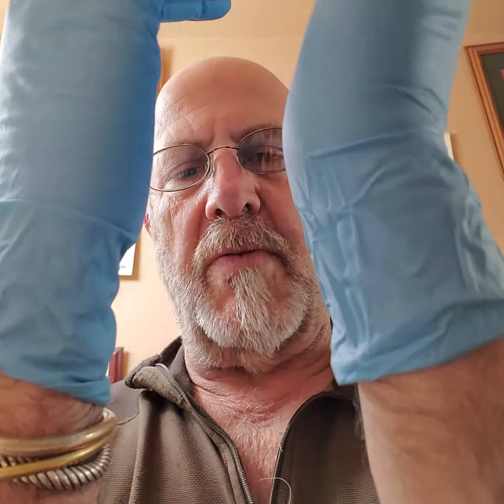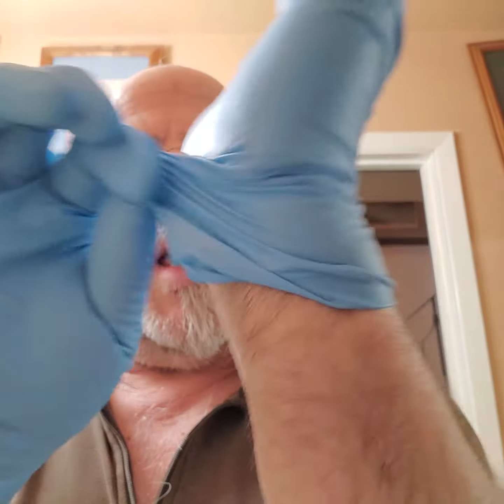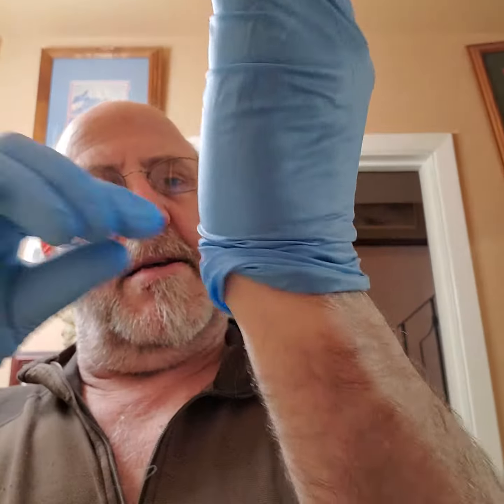So here is the process for contaminated glove removal. You grab the glove at the wrist, on the glove itself, and you begin to peel — always avoiding touching your skin.